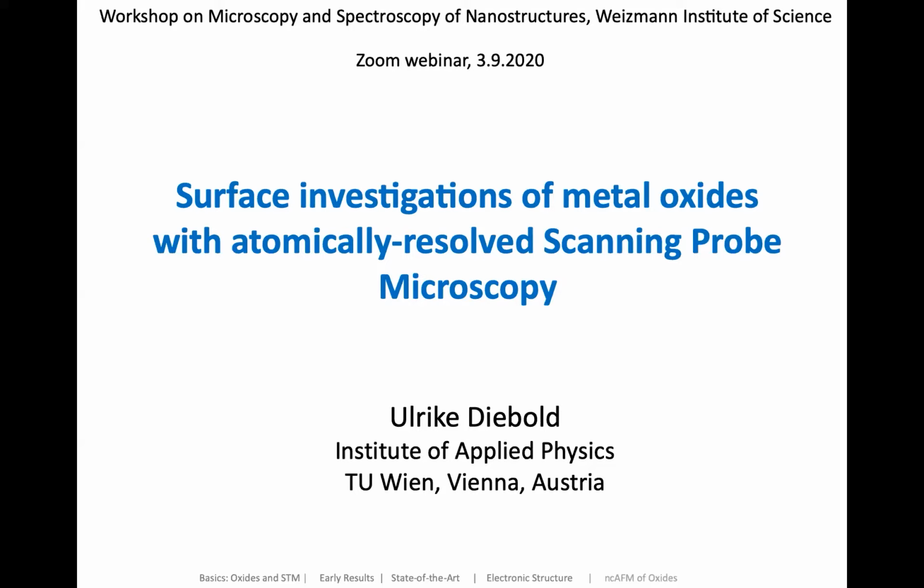So one thing for people here to make your life easier: I don't have page numbers, but I have here where I am, okay? This is the outline of my talk about basics, some results, and then it's all about scanning probe microscopy of oxides, okay?